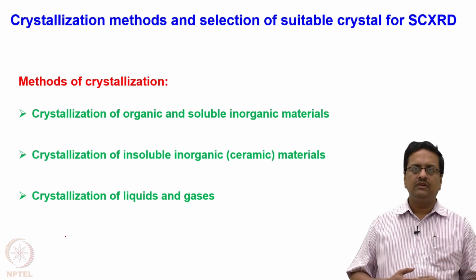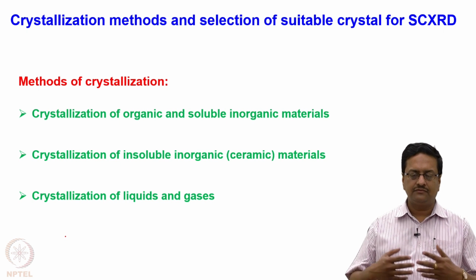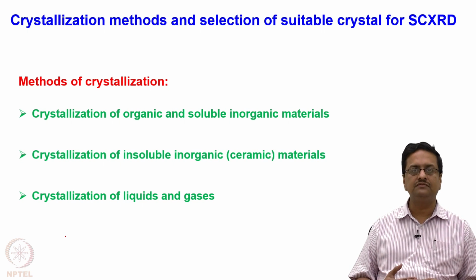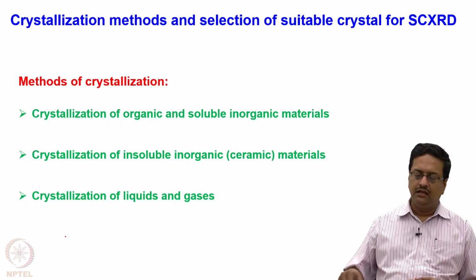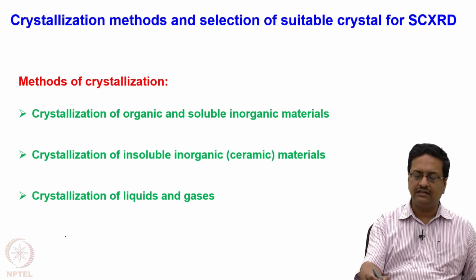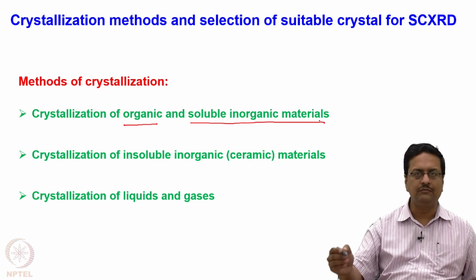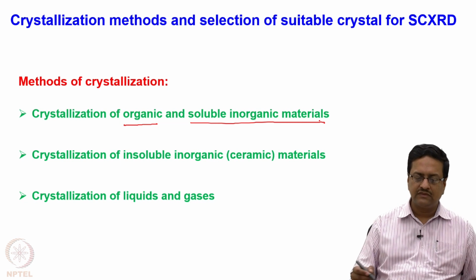In general, when we deal with different types of materials in the lab, we have different methods to apply for different types of compounds that we encounter. In most of the labs, we encounter different types of organic and soluble inorganic materials which can be crystallized using a particular type of method.